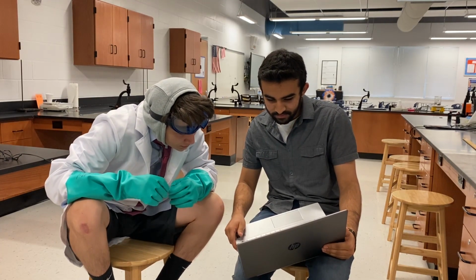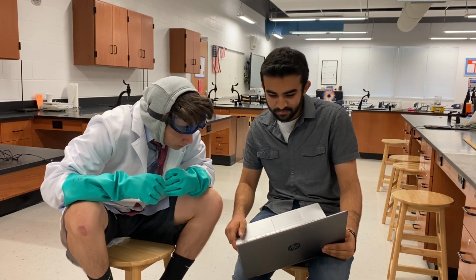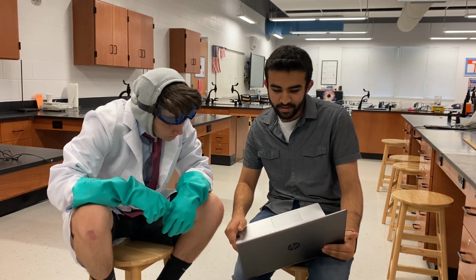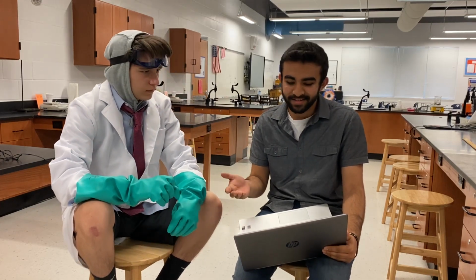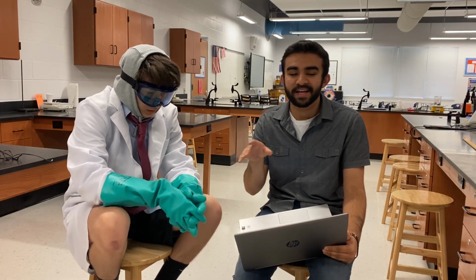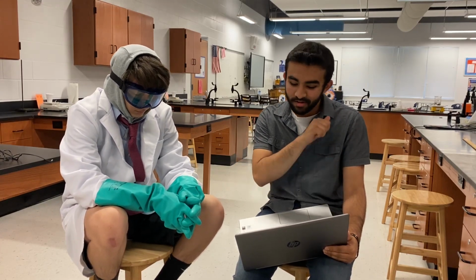Report any accidents, spill, breakage, etc., or injury, cut, burn to the instructor immediately, no matter how trivial it may appear. A lot of this does get redundant, but what you want to make sure is that you're safe, know what's in danger, and how to handle it. If you don't know what to do, call the instructor.